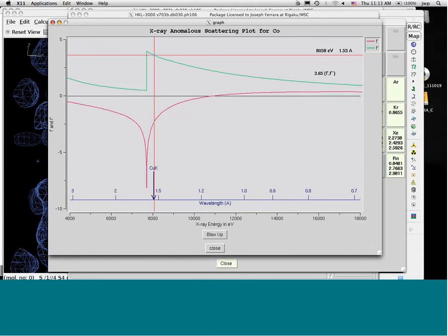So, if you have what you have, you can work at it, but it's probably best to spend your time on getting better crystals and becoming better at mounting them, so they don't slip. Crystal slippage sometimes is not really the crystal slipping. Some of these cryopins, if they don't warm the bases up to room temperature, will be moving quite a bit. At these fast beam lines, sometimes people don't give it a chance to come to thermal equilibrium, and the difference in the thermal expansion coefficients of all the metals causes these things to move around in the beam a little bit, and that can degrade the signal and increase the signal to noise.